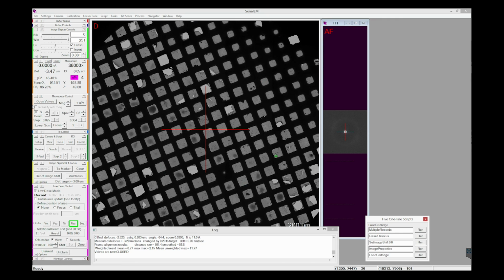And looking over at the other one, I could imagine where you'd have notes on this, but we have grid 2 in. It's in slot 2, so let's load slot 3. So I'll click load cartridge, press 3, and click run. The microscope's now going to go through that operation. Red box plus the long operation in the bottom right showing you that it's busy. Wait for those to release control of the microscope to you, and you are good to continue this again as a loop. Thank you, and I hope this was informative.